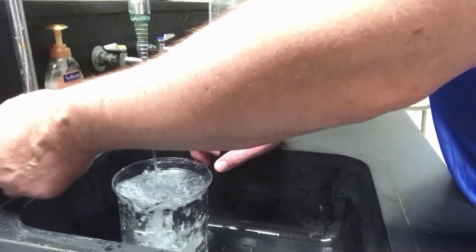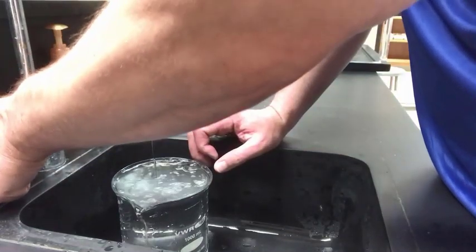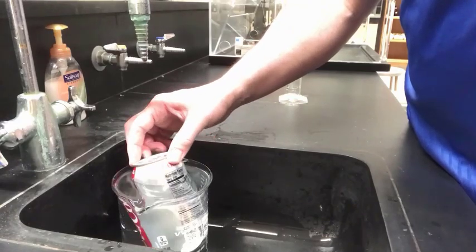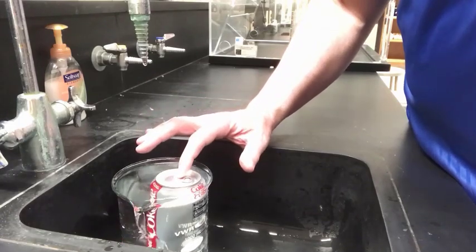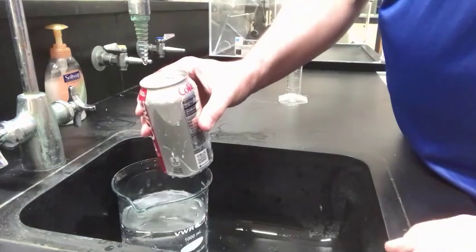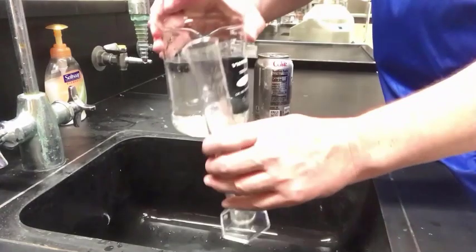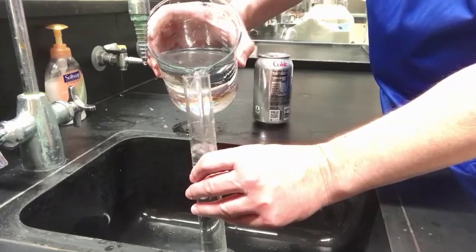Fill it again right to the brim, only this time you're going to put one of the soda cans in. If it's a soda can which floats on the surface, the one that's less dense in the water, make sure to dip the can under the water level, but only just, so that we measure the full volume of the soda can. The volume of the soda can is displacing water from the beaker. So the volume of water remaining is the difference between the full beaker and the beaker after it's had a soda can added.